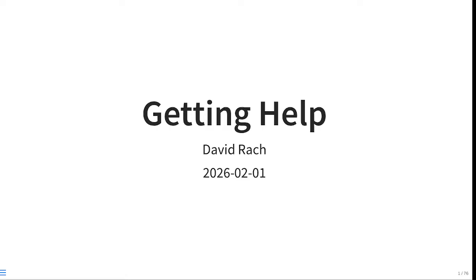So today we're going through one of the other pre-course walkthroughs, specifically the Getting Help tutorial, in which we will mention the different ways that you can get additional feedback, additional help, anything that you may be encountering as you're working through the different lessons in the Cytometry and R course, because I realize a lot of you will be at institutions where you'll be the only person doing this, so we want to make as many options available as far as how to get additional help when you encounter a barrier that you just can't troubleshoot yourself.